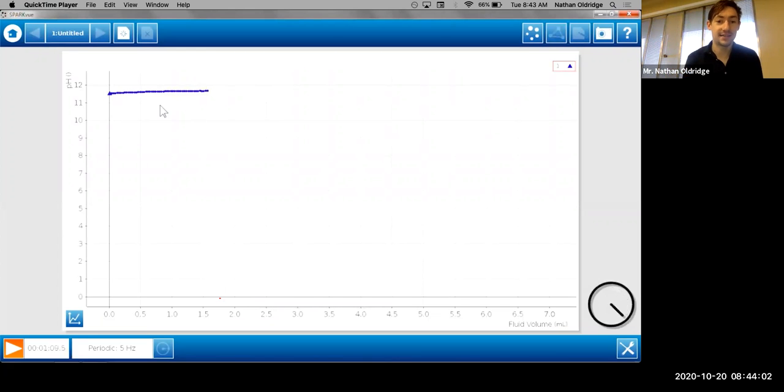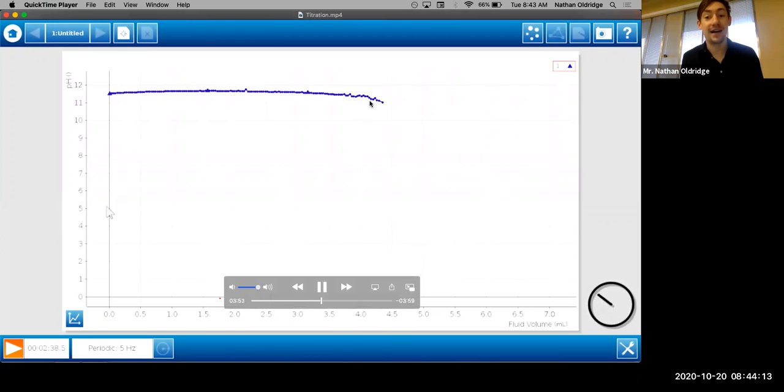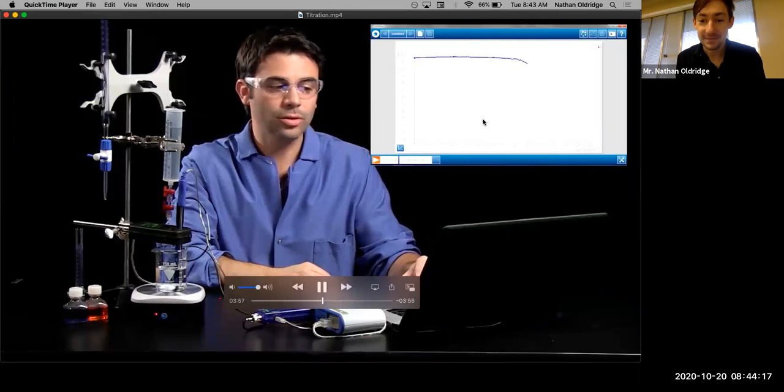Why would that be the case? That's the case because pH is a logarithmic scale. So you have to neutralize 90% of it to get a 1 unit change in pH. Oh, here we go. Now the pH is finally dropping. He's excited. You can tell.